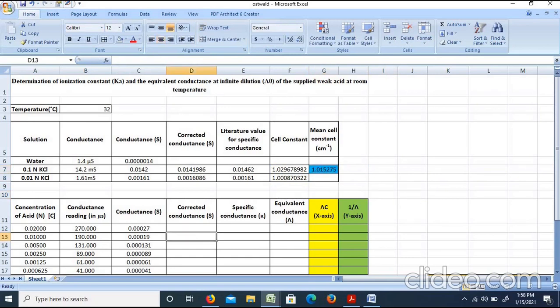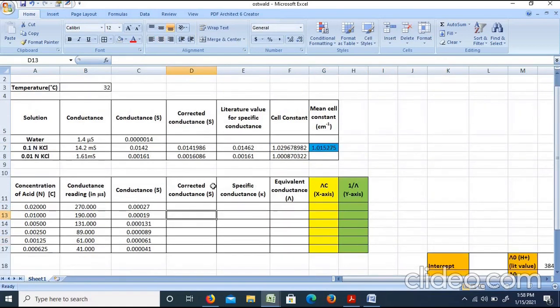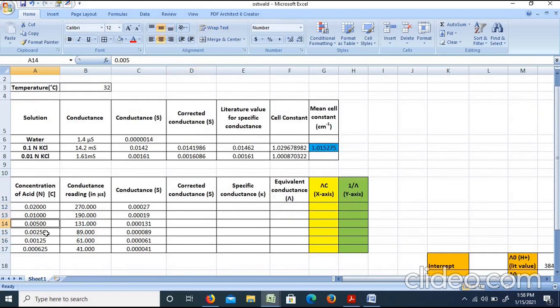Next, for the acetic acid solution, we measure the conductance values at different concentrations: N/50, then half-diluted to N/100, N/200, N/400, N/800, and N/1600. We note the conductance value for each concentration of acetic acid solution.